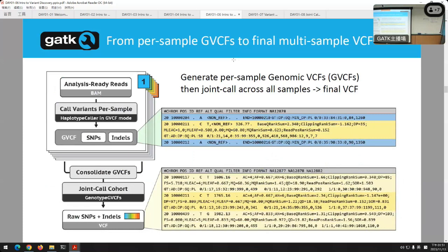So I'm going to skip this a little bit. This is, again, to show, Aaron will cover this too, but we have a special format for dealing with data that's going to be jointly analyzed. It's kind of VCF-like. So when I show you the HaplotypeCaller soon, there's a mode where we don't fully make variant calls. The HaplotypeCaller goes from a BAM file, your reads, to variants. But in this mode, it's going to almost make variants. It's going to make something close to them, and that's what this is. And it'll still do all the math and all the smarts.